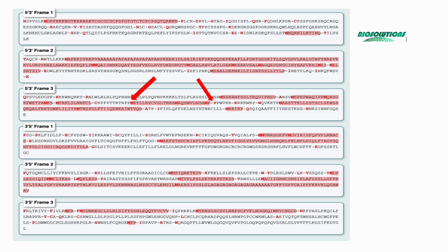But why are there so many ORFs? Translation can begin with any methionine, but if a stop codon comes too early after the start, it interrupts the translation frame, making the translated sequence non-functional. Therefore, we will be looking for a red highlighted ORF with at least more than 100 residues without any stop codon in between.